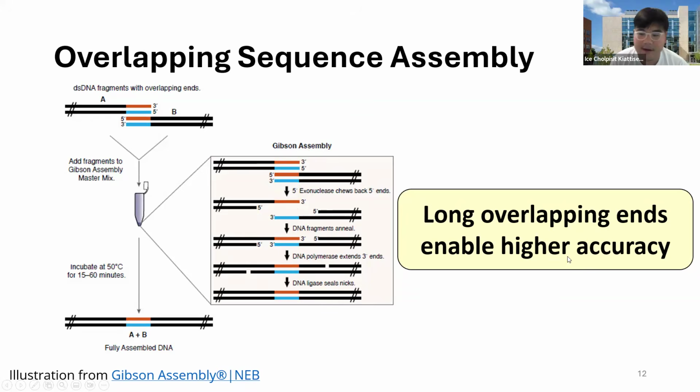So most of the time, if you get any positive results when you are putting these DNA into the bacteria, they are likely correct.